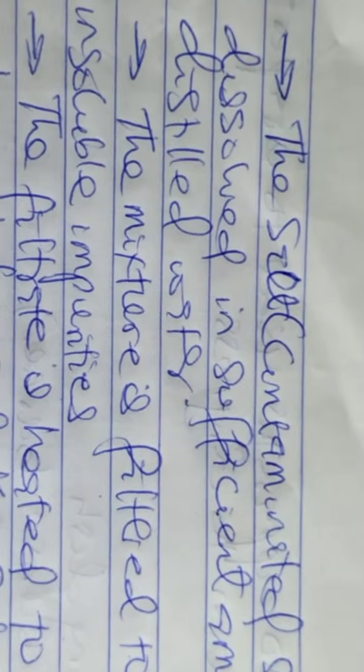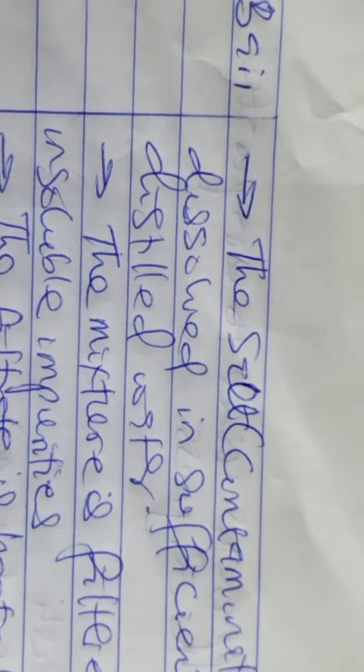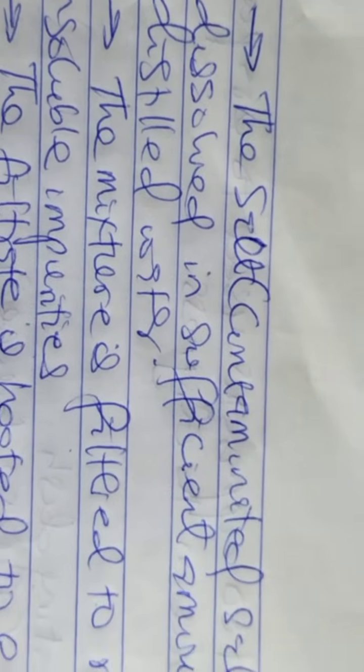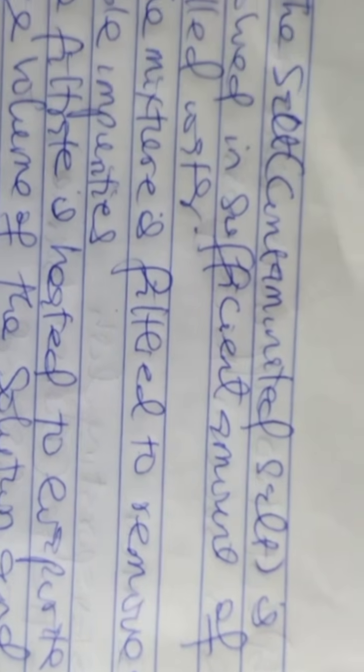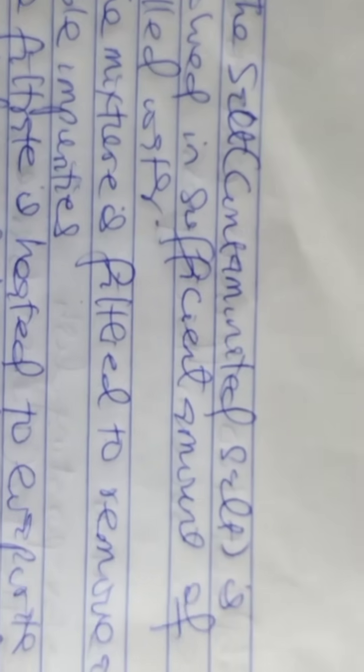So the procedure must involve crystallization. We'll now move to the procedure, step by step. The first step, the contaminated salt is dissolved in a sufficient amount of distilled water.